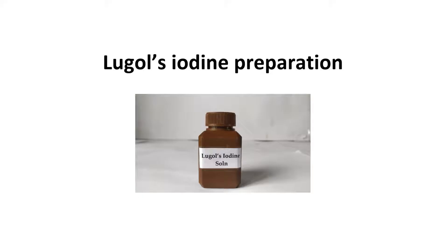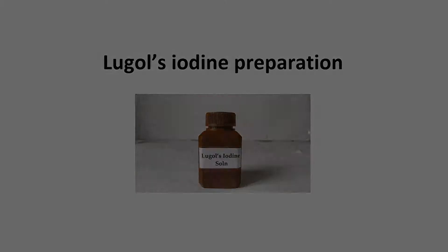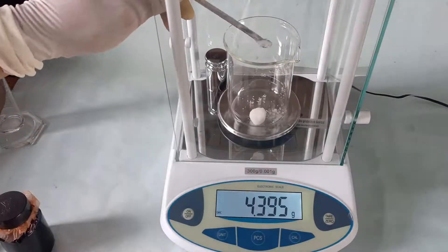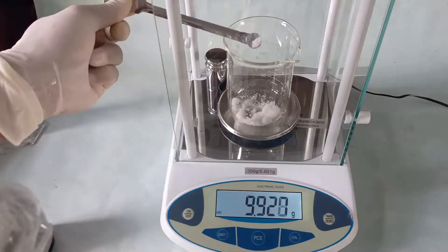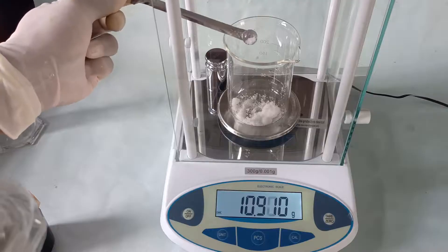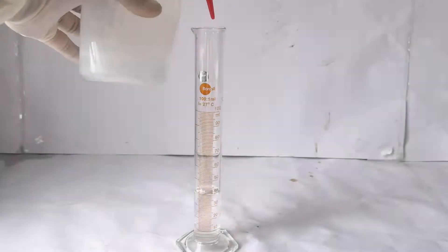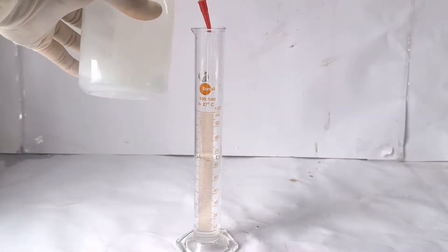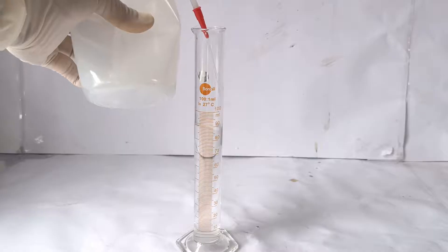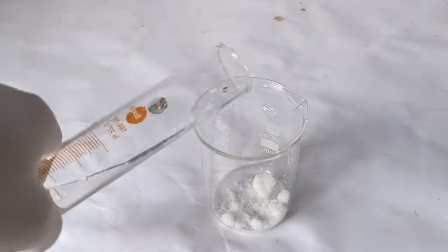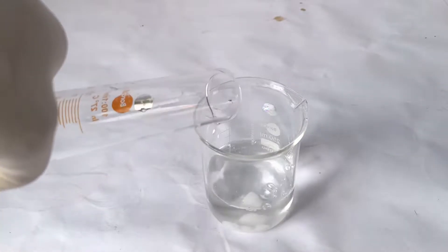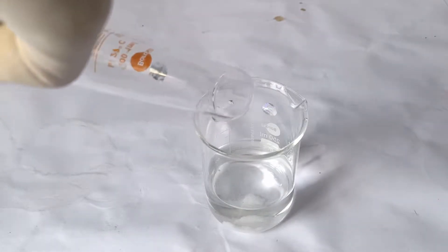To prepare 100 ml of Lugol's iodine solution, first weigh 10 grams of potassium iodide in the beaker. Then measure 100 ml of distilled water using the graduated cylinder, pour this into the beaker containing the iodide salt, and stir to completely dissolve the salt.